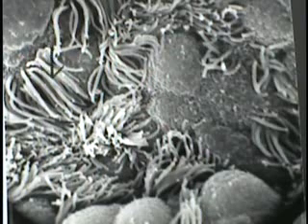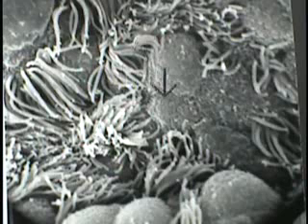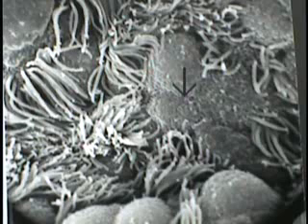And this is what the individual cilia look like when seen from the surface, and you can see there are groups of them indicating they're all coming from a single cell, like this cluster here, coming from the top of a specific cell. So this is the surface lining epithelium of a bronchiole, but seen at increased magnification.